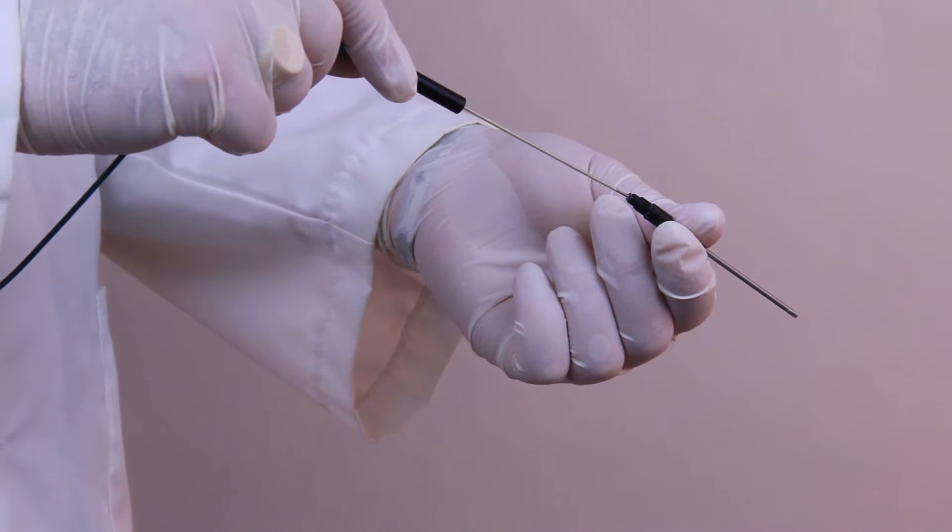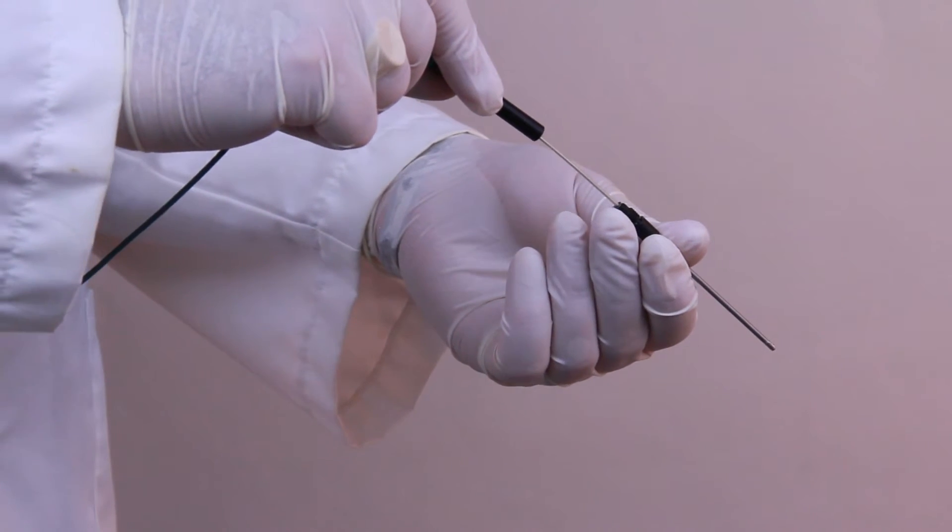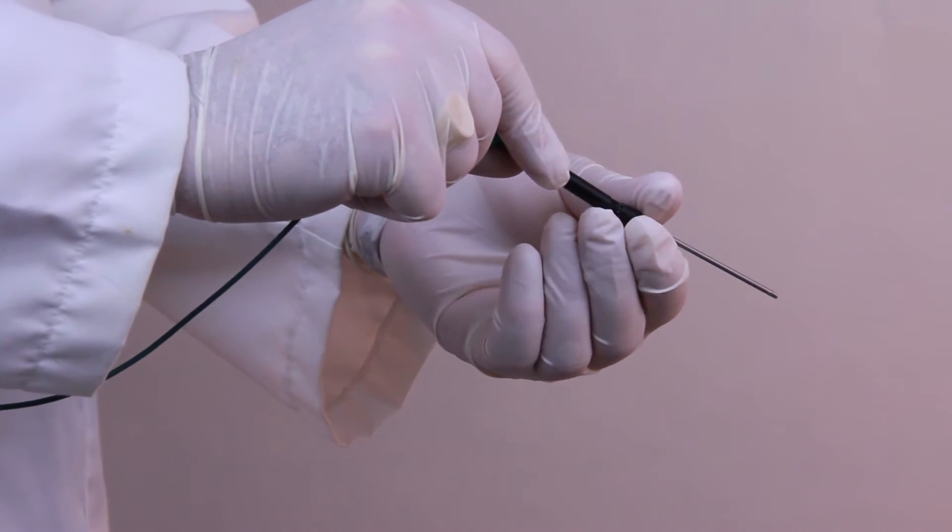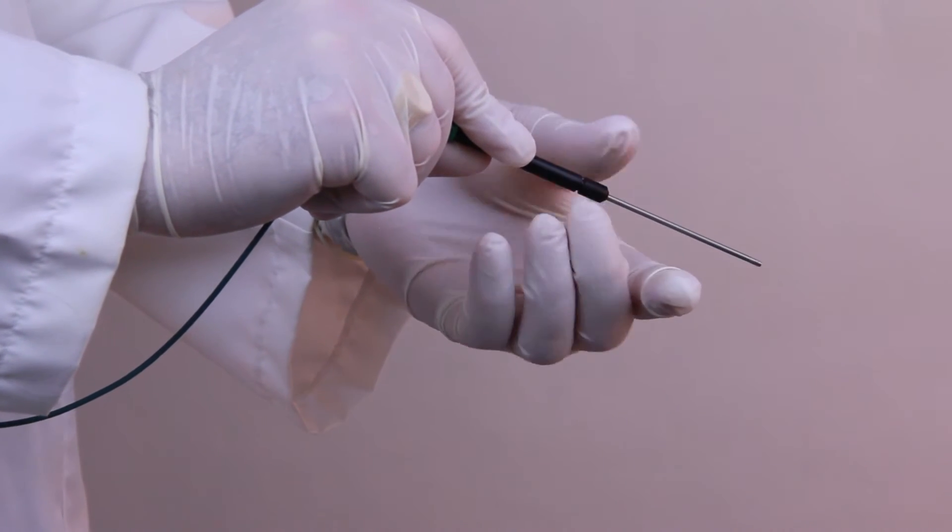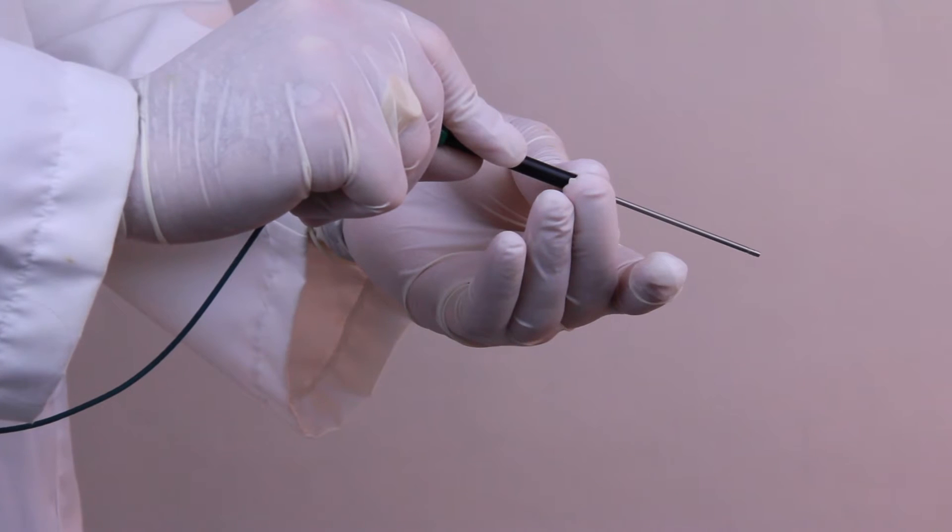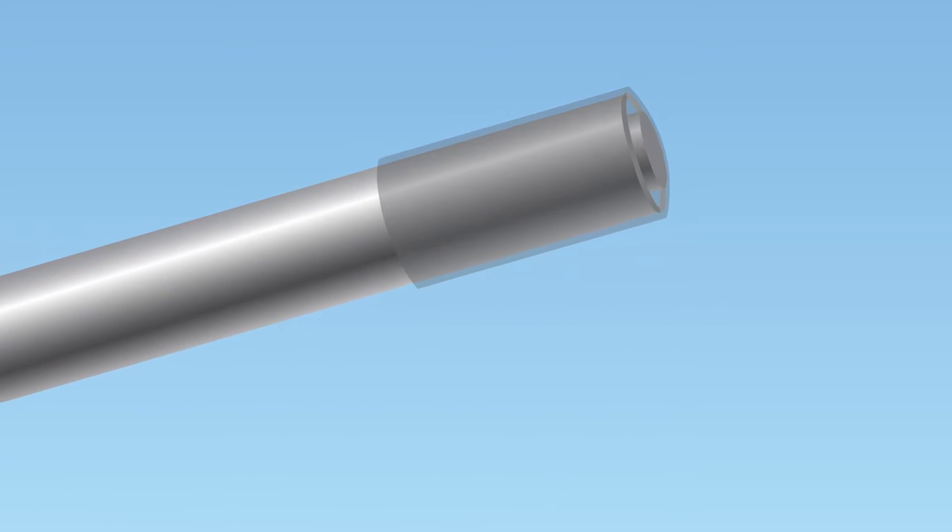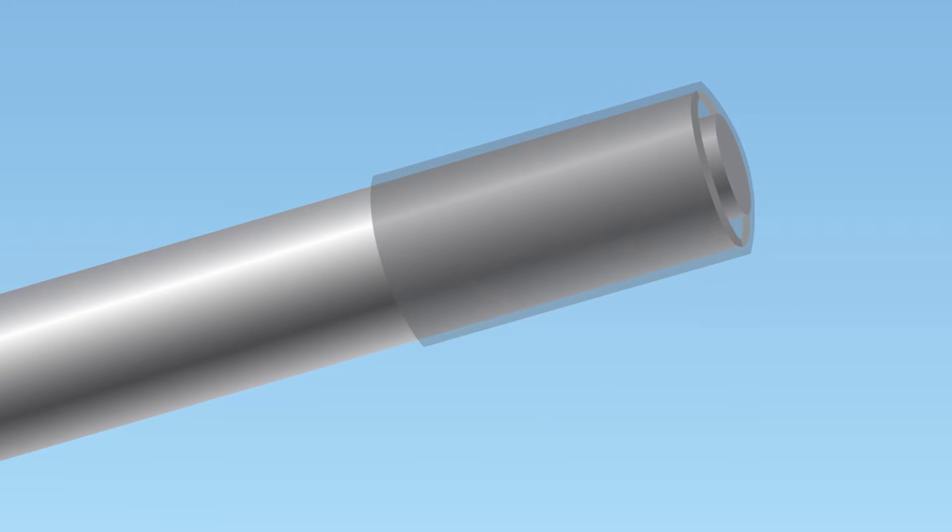Insert the sensor into the sleeve. Some electrolyte will spill out during this step. Tighten the locking cap to the sensor. The tip of the sensor will just slightly push on the membrane.